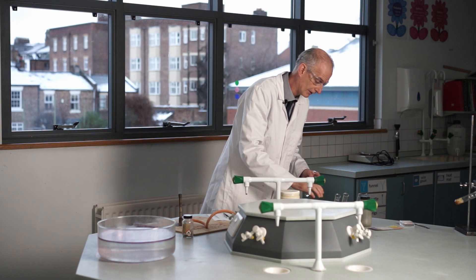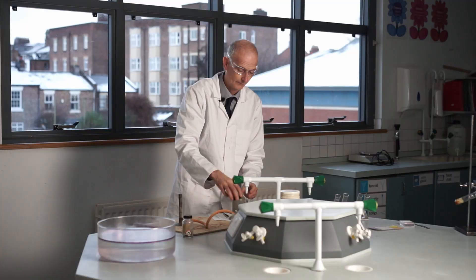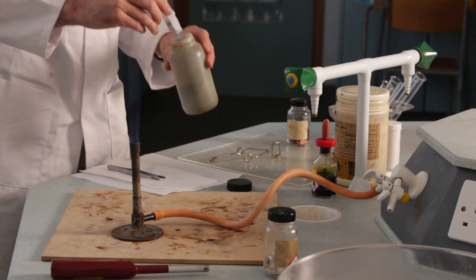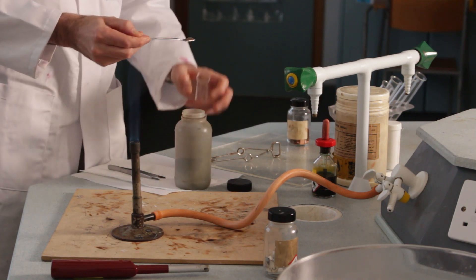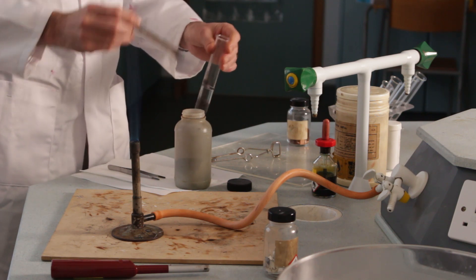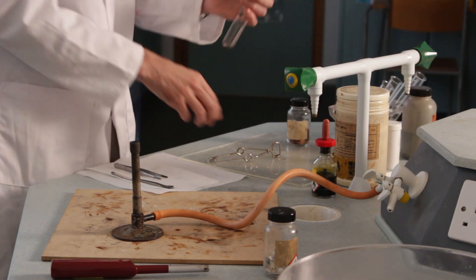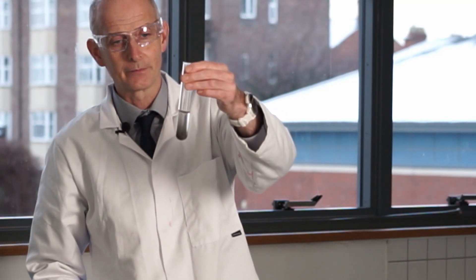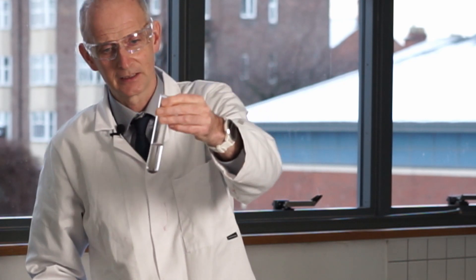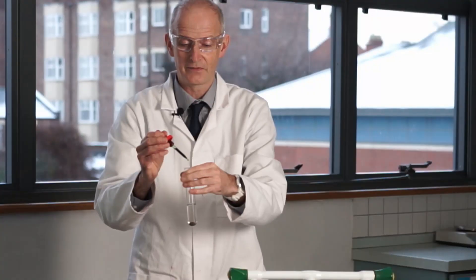Iron is the next on the list. We've got iron filings — finely divided iron rather than an iron nail. When you finely divide something you increase the surface area, so it could be more likely to react as a powder than as a single chunk. Put that in, give it a shake, and look for any bubbling. Nothing doing — can't see any bubbles. I'm going to put a little bit of indicator in again.